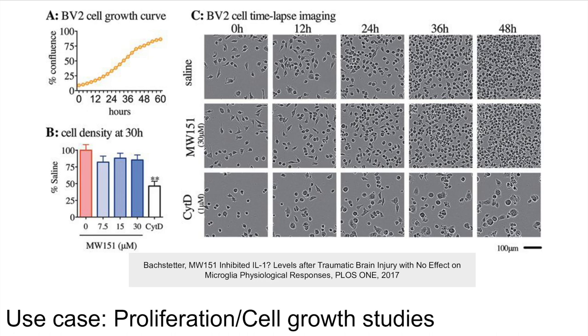A challenge with live cell imaging is that slides can't be stained to make the cells easier to count, because it would disrupt the function and likely kill them. Instead, they are counted using standard bright field microscopy and can benefit from computer vision approaches to counting.